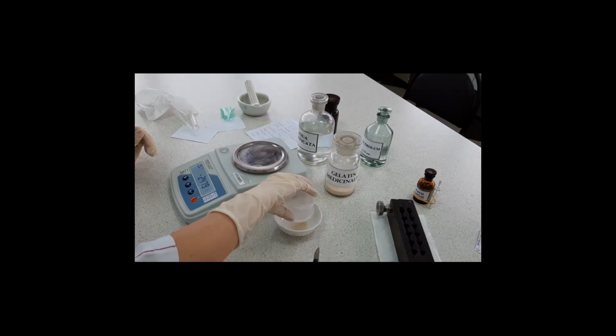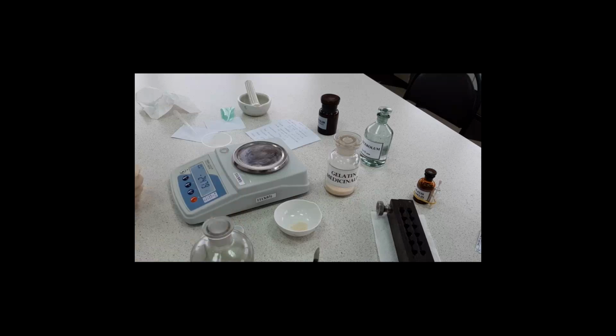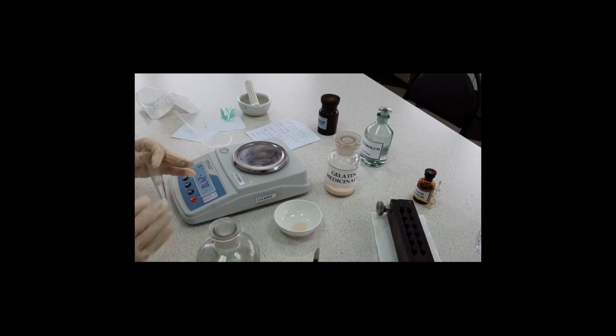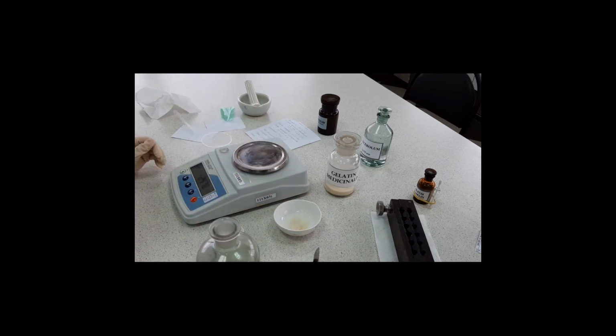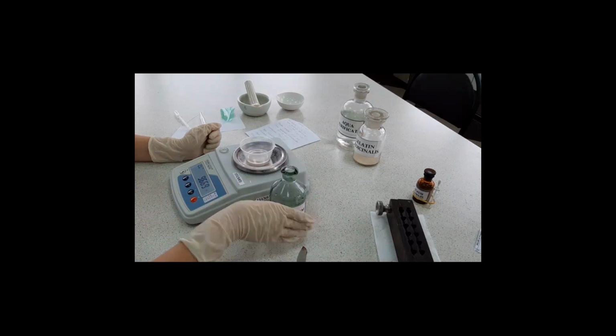sequentially. Place gelatin in a porcelain cup and pour in the calculated amount of water. Leave it to swell for 30 to 40 minutes. Then weigh glycerin and protargol.